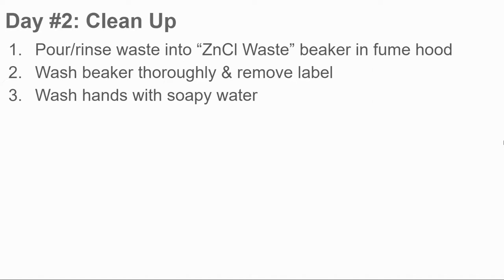So for cleanup, we want to pour and rinse the waste into a waste beaker in the fume hood, and then wash thoroughly and take off the label, and then of course wash your hands with soapy water.